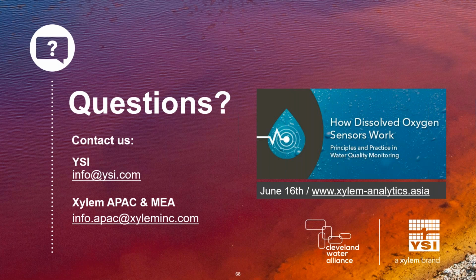Now, if they're talking about storage, which I'm imagining they are talking about, short term I would say is going to be anything less than a month, and long term is anything longer than a month. Everybody's going to have their own little definitions there. So if you ever really want to know, I would be specific and say, hey, is this okay if I do this for 2 weeks? In general, when I said short-term versus long-term storage in this webinar, I generally mean less than a month, more than a month. Okay, terrific.